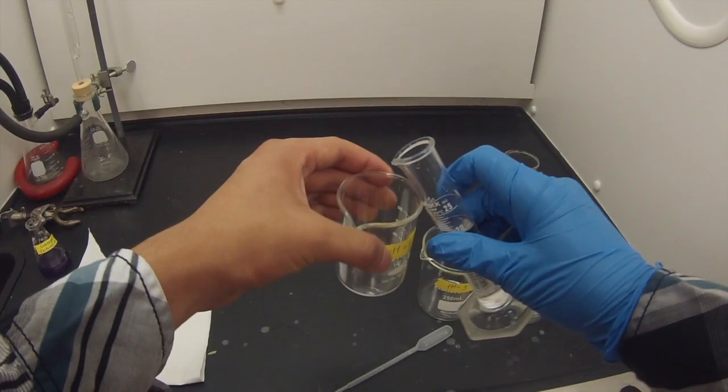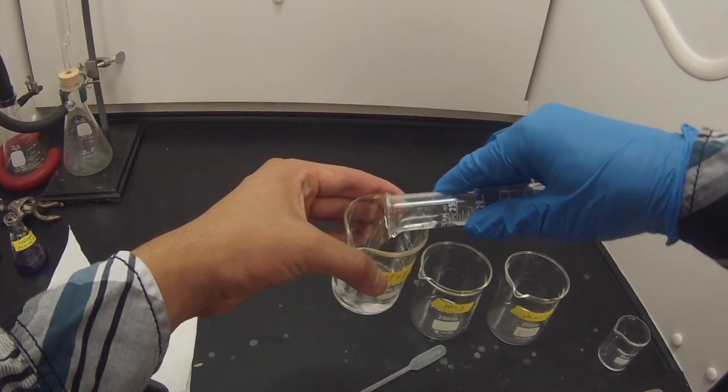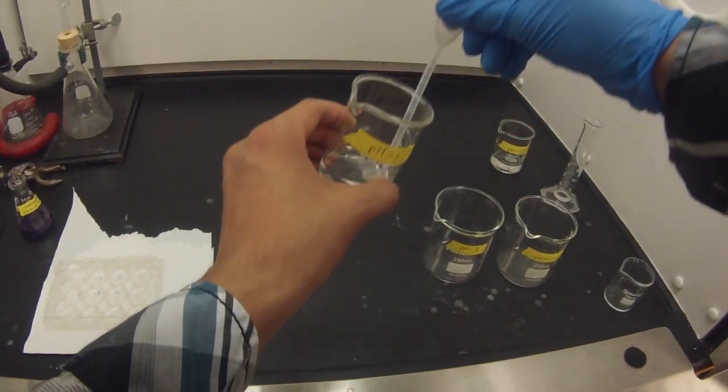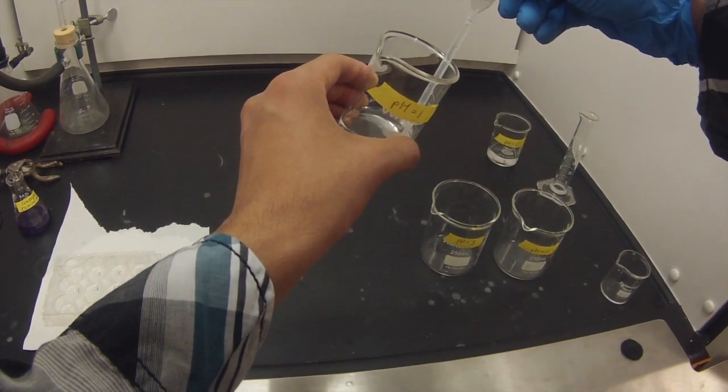Making the pH solutions, you'll want to take 20 milliliters of hydrochloric acid and add that into a 100 milliliter beaker labeled pH 1. From this, take one milliliter and add it to a 250 milliliter beaker labeled pH 3.